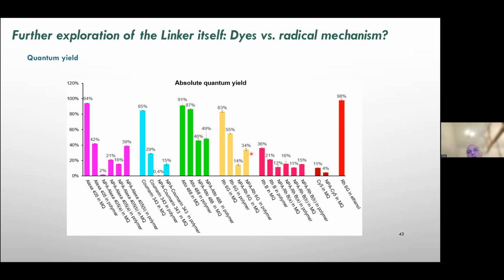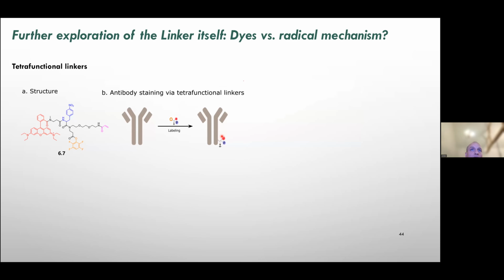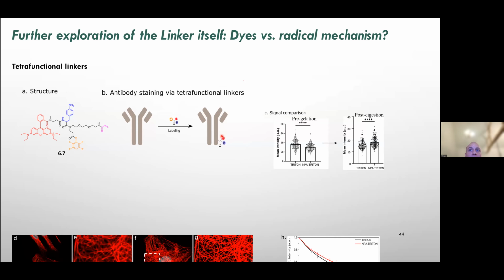But when you then go into the polymer, the quantum yield actually increases again. So what this shows is that there are some crowding effects and some quenching effects that are not yet fully understood. But do they work? Yes, they work, and they have some interesting effects.